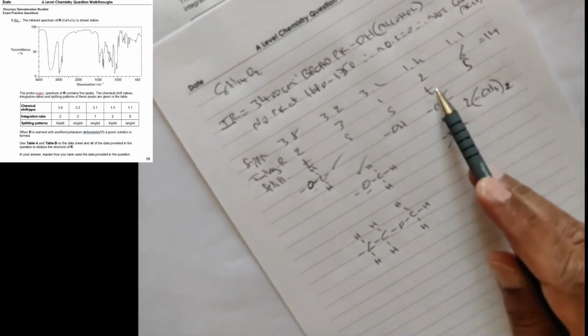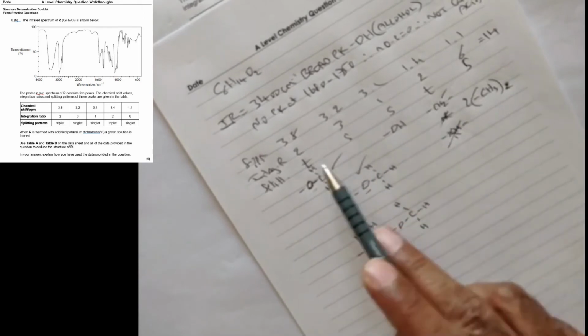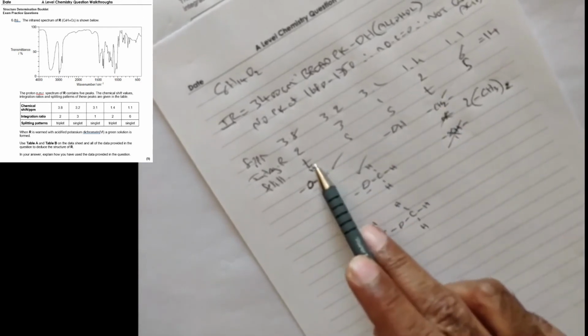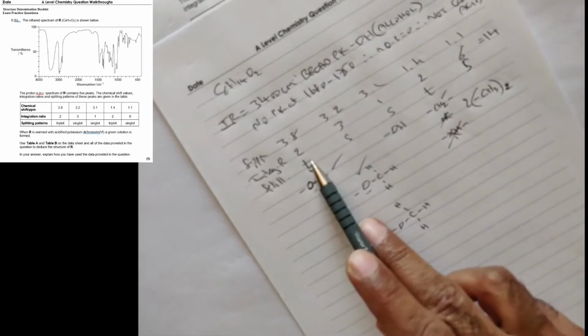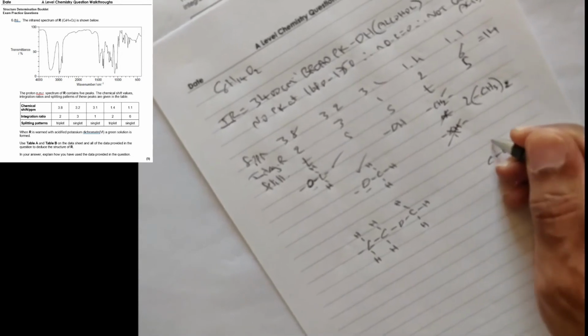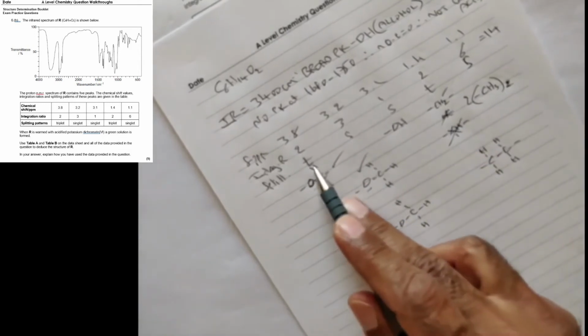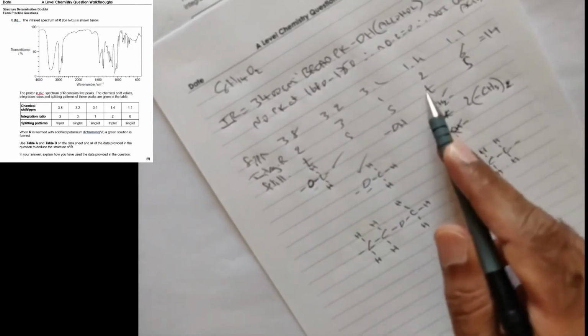Whenever you see 2 triplets, whether it says NMR spectrum or in a table like that, it's a quick way of realizing that there's this group present in that molecule: 2 CH2s side by side, and you'll notice there are my 2 CH2s side by side. So a quick trick is, as soon as you see 2 triplets, assume that there's going to be 2 CH2s side by side.